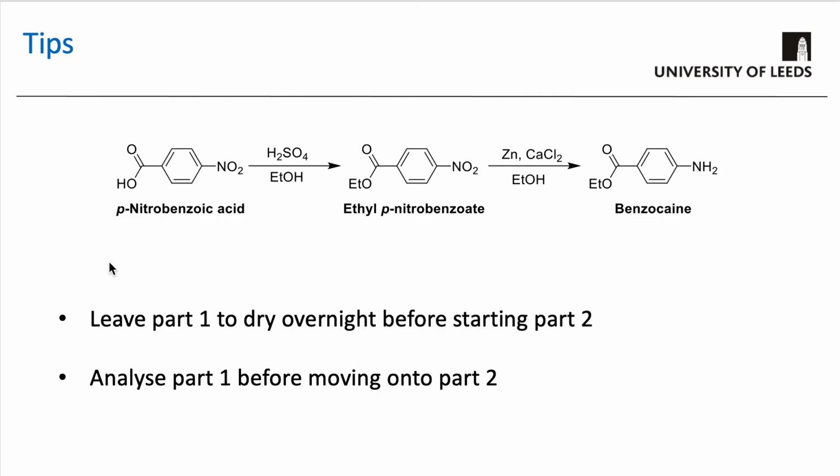In terms of tips, as I mentioned before, leave part 1 to dry overnight. You could leave it in a desiccator, for example, and then check the data before starting and moving on to part 2. That's the main tip of this experiment.